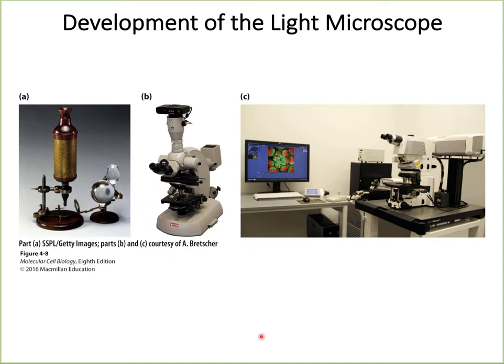In the second half of the 20th century, fluorescence microscopy, confocal techniques, and in the recent past several super resolution microscopic techniques pushed light microscopic resolution into the nanometer scale, previously thought impossible without an electron microscope.